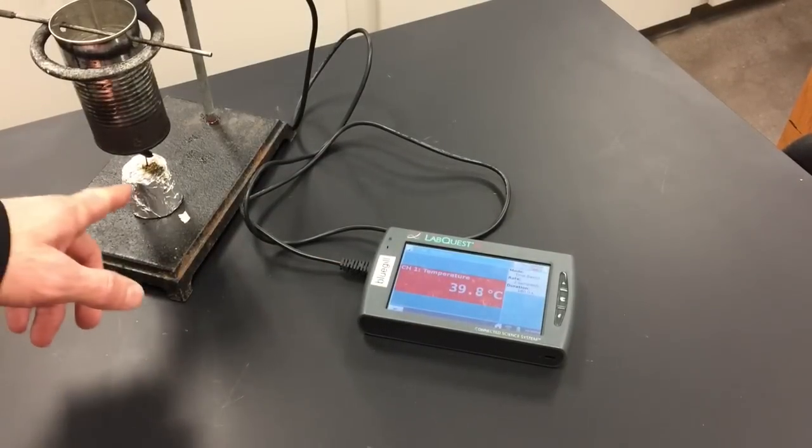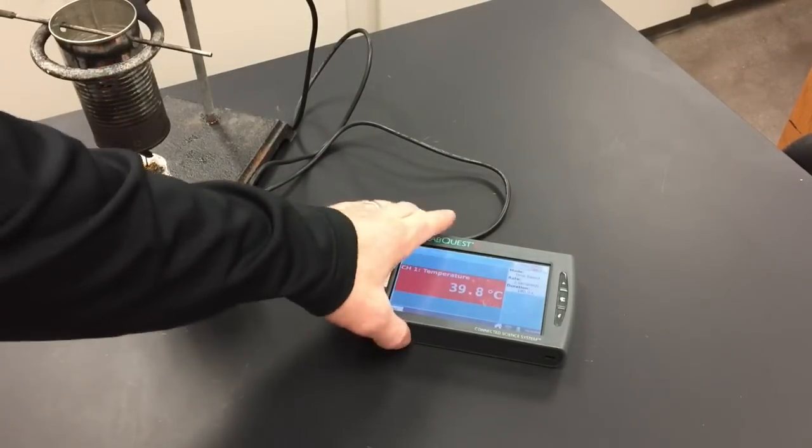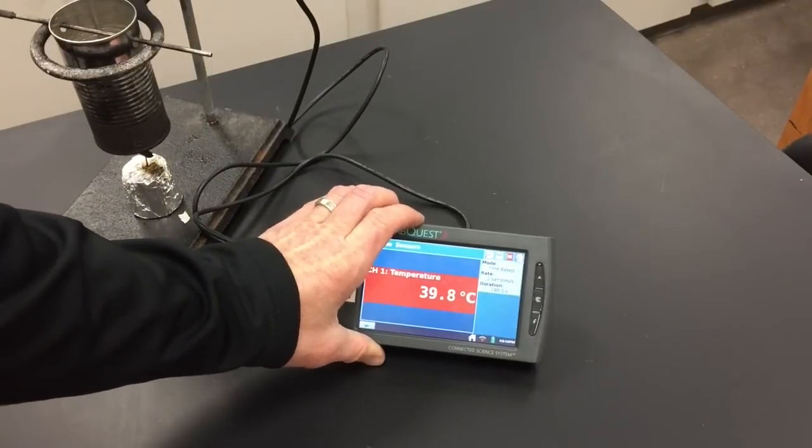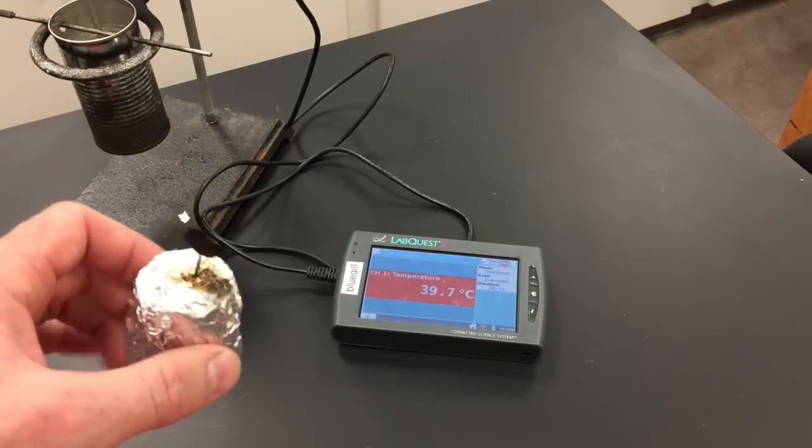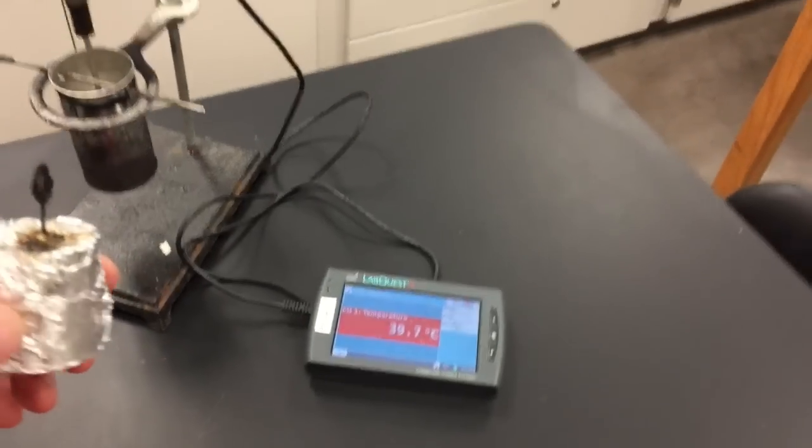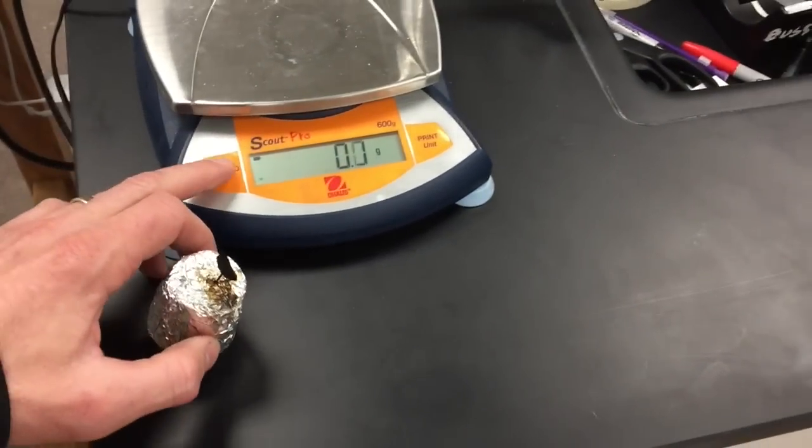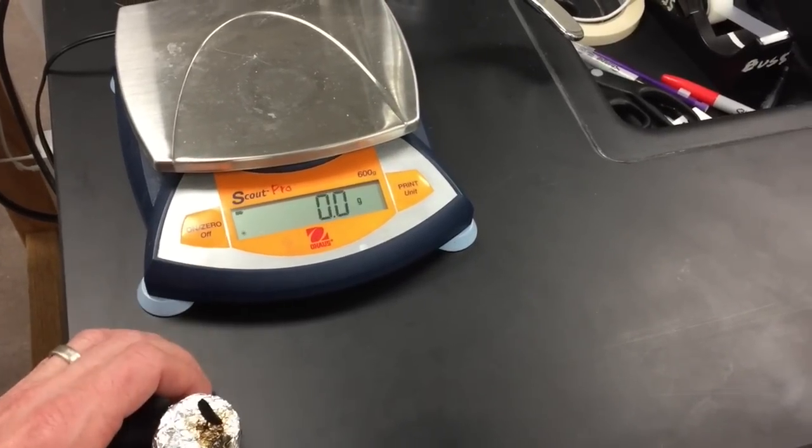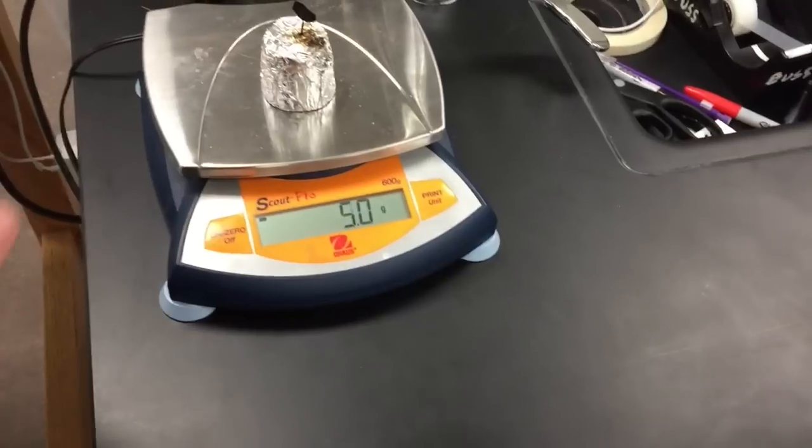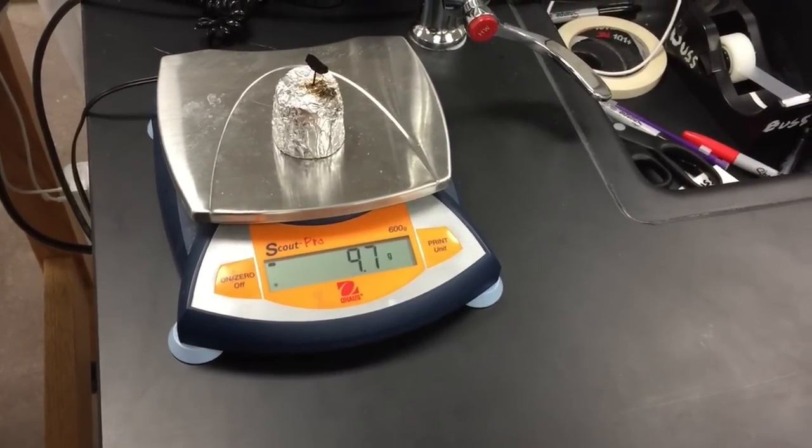Now that my food is completely burned, I need to write down the final temperature of the water before it starts cooling off again. Then I also need to know what the final weight of the food item burned was. So carefully I'll bring this over to the scale, make sure it's zero, and I'll write down the final weight of the food item.